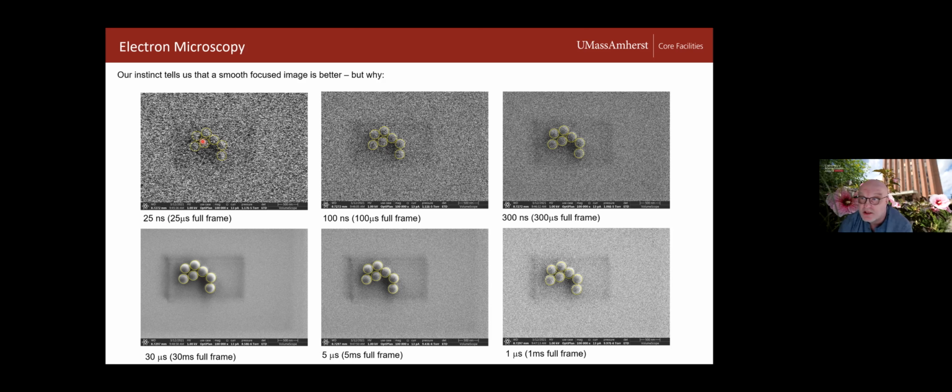So what does this provide? That provides speed. If you want to image particles in an electron microscope on a liquid surface, you need speed. This is what speed provides, by sacrificing image quality, so to say. And this is where our ionic liquids come in. We put ionic liquids into the electron microscope, and since they have virtually no vapor pressure, they will not evaporate, even at 10⁻⁵, 10⁻⁶ torr. And because we were so excited that this polymer film was actually floating on an ionic liquid, we were hoping other stuff would float on that as well. And it did.